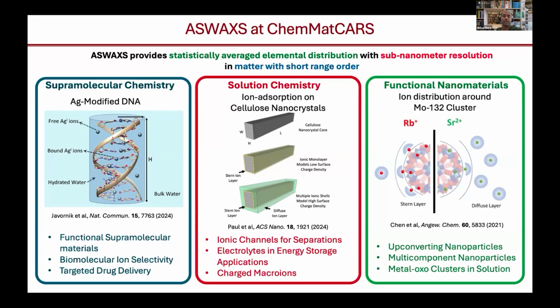In solution chemistry, we are targeting ionic channels, electrolytes, and charged macroions. The cartoon you are seeing is our recent work where we can see how ions interact with cellulose nanocrystals. So all the interactions within solutions you can probe with anomalous small angle X-ray scattering.